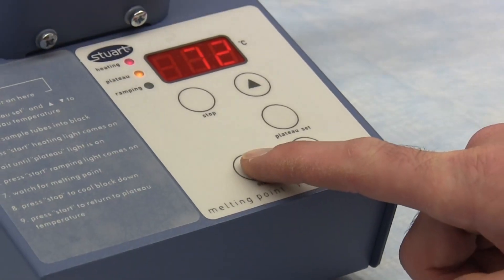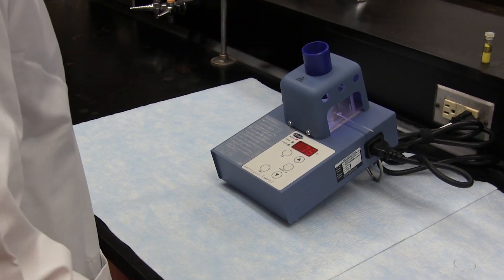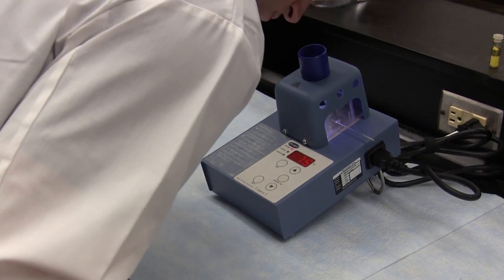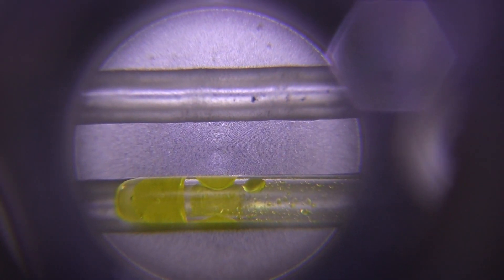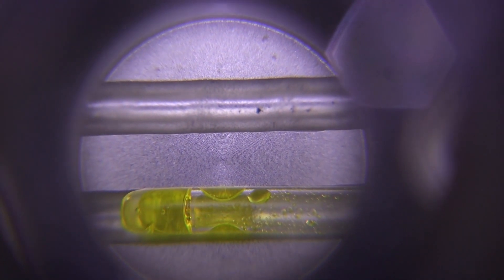Melting point is one of the main physical properties in preparative organic chemistry because the melting point of a compound can give us important qualitative information regarding the purity of a sample synthesised in the lab, and it can also help us in identifying a chemical compound.